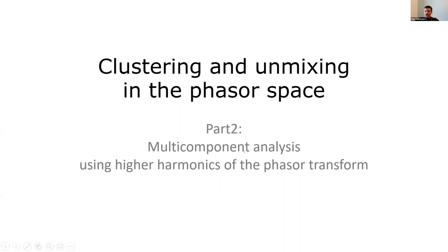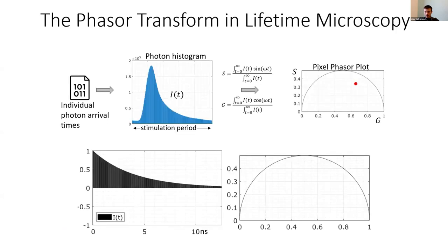Okay, well, moving on to the second part. Multi-component analysis using high harmonics on the phasor transform. You have learned this morning about the phasor transform. I'm going to do a quick recap.